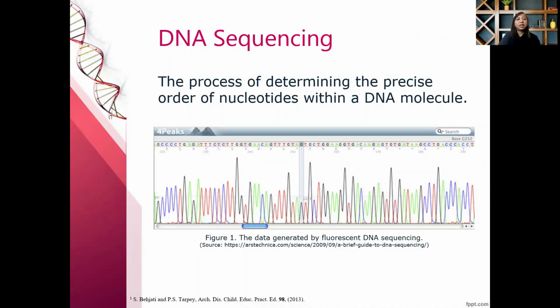DNA sequencing is a laboratory technique used to determine the exact sequence of bases such as adenine, cytosine, guanine, and thymine in a DNA molecule. The DNA base sequence carries the information a cell needs to assemble the protein and the RNA molecule. DNA sequence information is important to scientists for investigating the function of genes. The technology of DNA sequencing was made faster and less expensive as a part of the Human Genome Project.